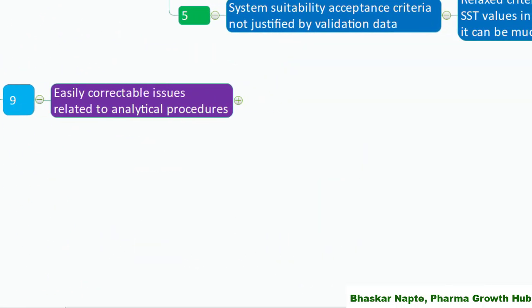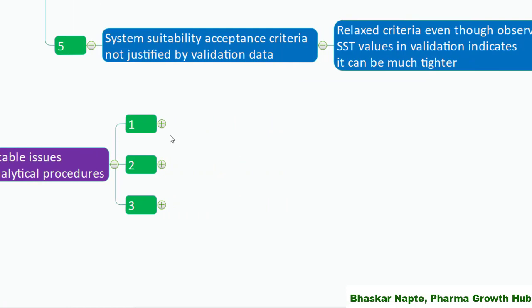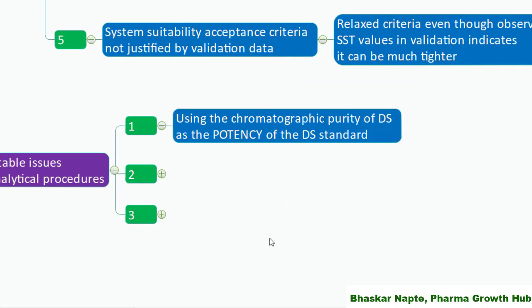Here are the easily correctable issues related to analytical procedures. The first one: using the chromatographic purity of the drug substance as the potency of the drug substance standard. There is a subtle difference between purity and potency of a drug substance. Do not use chromatographic purity as a potency value. Have a suitable SOP to calculate the potency and calculate it according to that SOP.